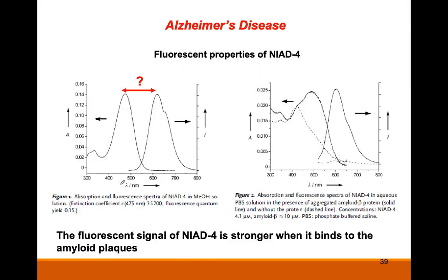So you can see here there are two spectra. Before we can get this fluorescence spectrum, the right side, we have to decide on what is the excitation wavelength. Because if you don't excite the electron with the right amount of energy, you will not be able to get the fluorescence.